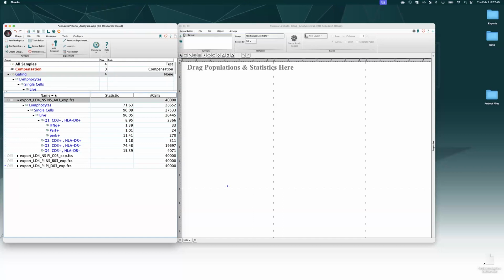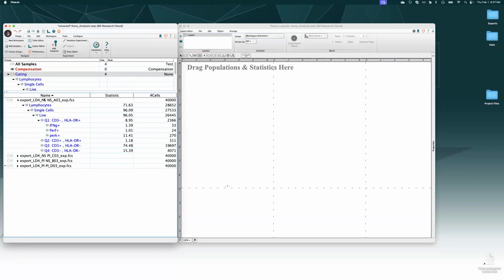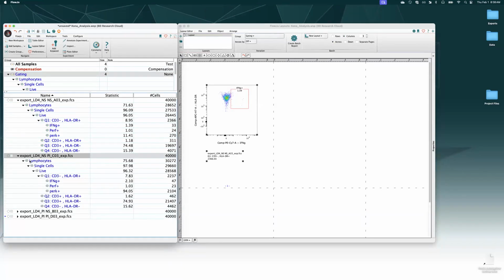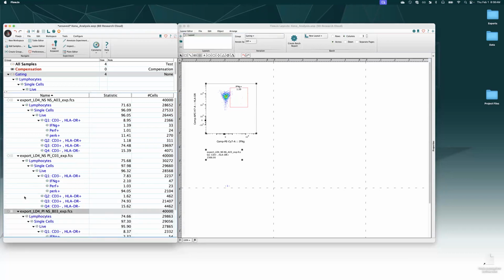I'm gonna sort these differently real quick. So you can click along these headers, double click to sort based on the file names. If you had another keyword, for example, maybe you add a keyword and then give numerical values, you can sort your samples in the workspace by those numerical values. But here, I'm just gonna create an overlay so that I can set up a layout basically for batching. But I'm not gonna perform the batching yet because the purpose of this is to create a template.